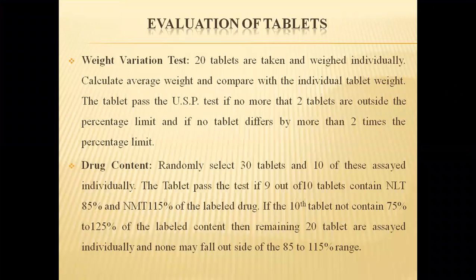Hello everyone, this is a D Pharmacy Pharmaceutics 1 class, subject code 1.1T, Unit 5. Today we are going to discuss the official tests for evaluating tablets. There are four official tests for tablet evaluation. Among them, the first one is weight variation test.